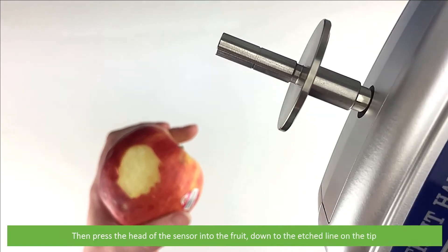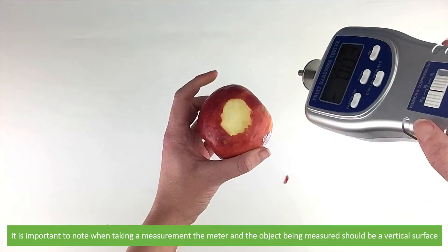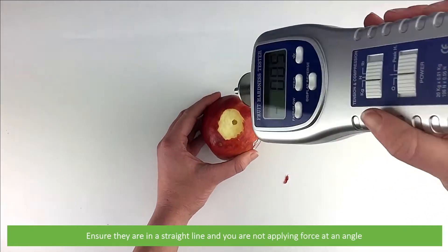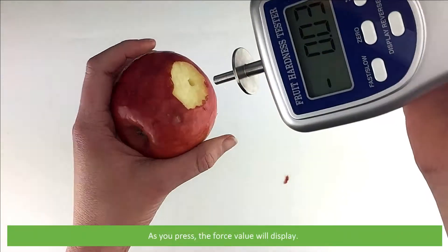Press the head of the sensor into the fruit down to the etched line on the tip. It is important to note that when taking a measurement, the meter and object being measured should be vertical. Ensure that they are in a straight line and you are not applying force at an angle. As you press, the force value will display.